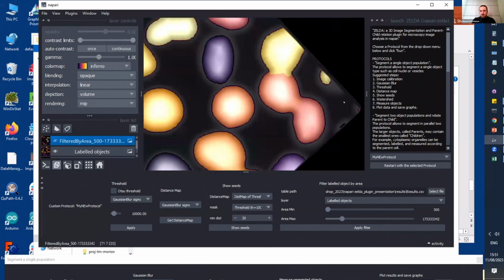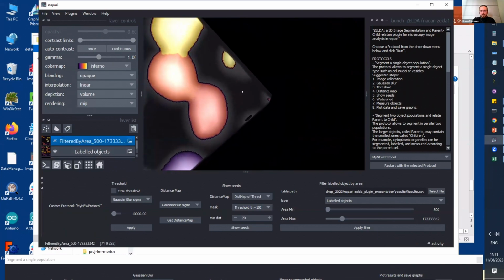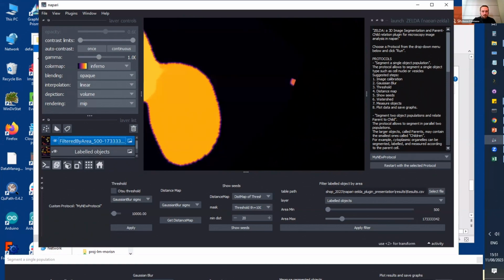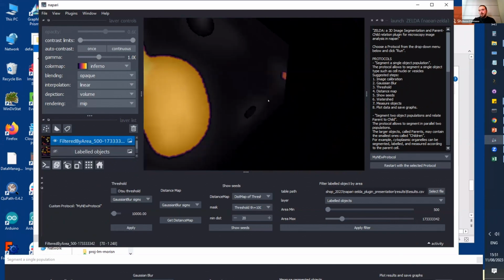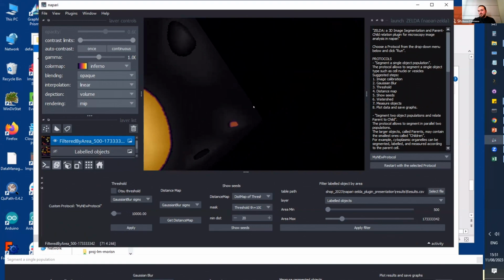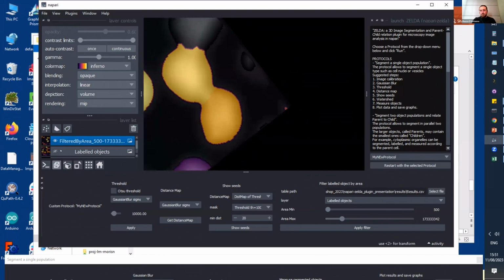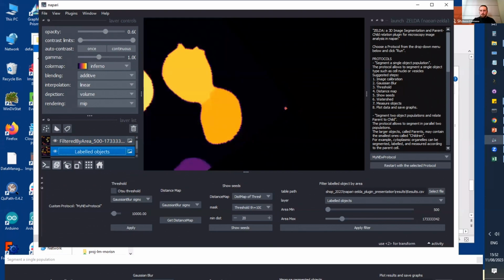And I have just a doubt about this thing in the corner, why it is showing. It is showing anyway, so I'll double check if there is some odd behavior in the corner. But in principle, this should be the widget that you can use to filter. Okay, it looks like there are no other questions.